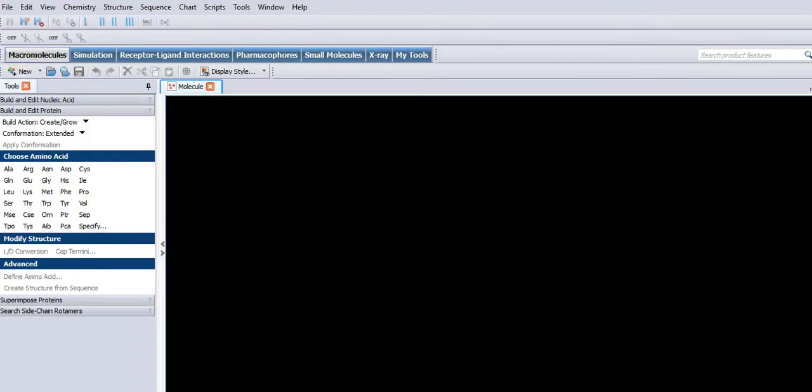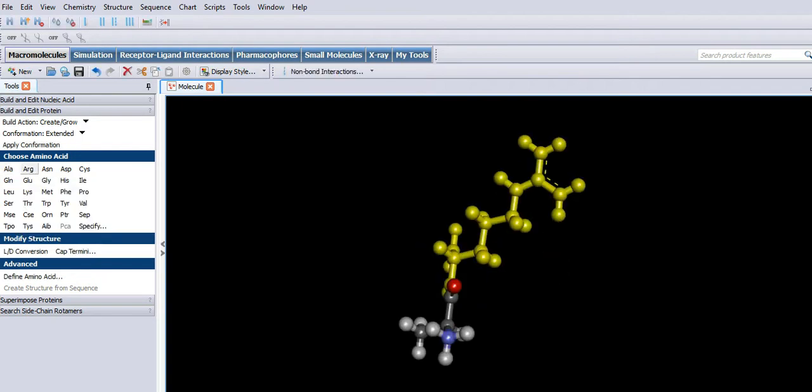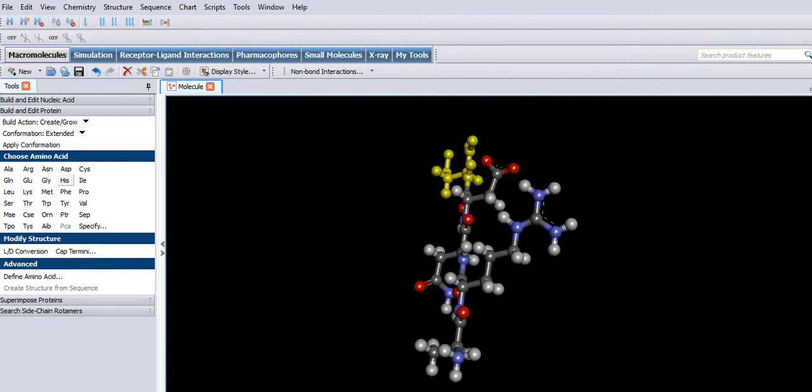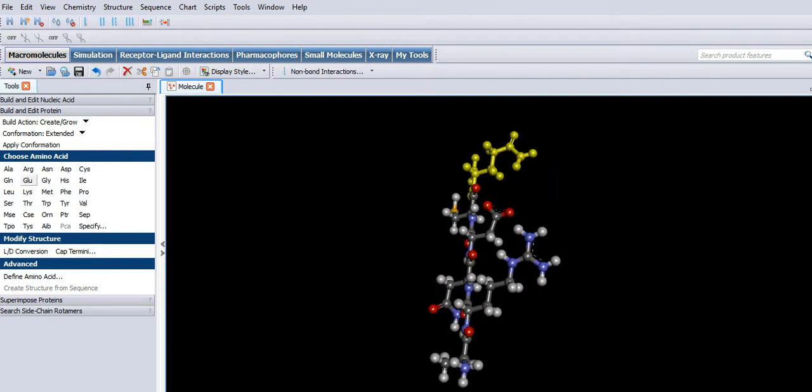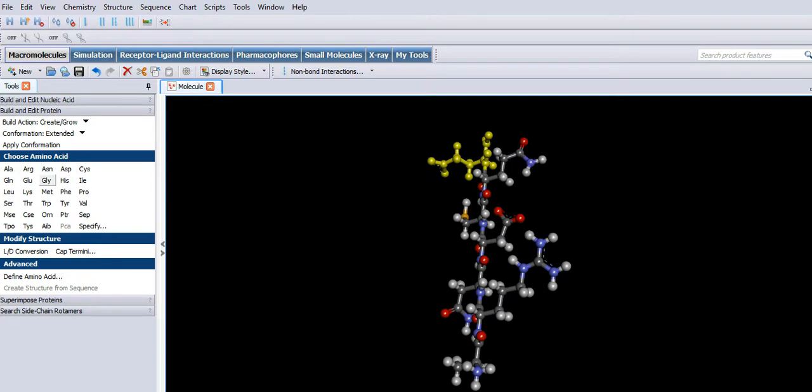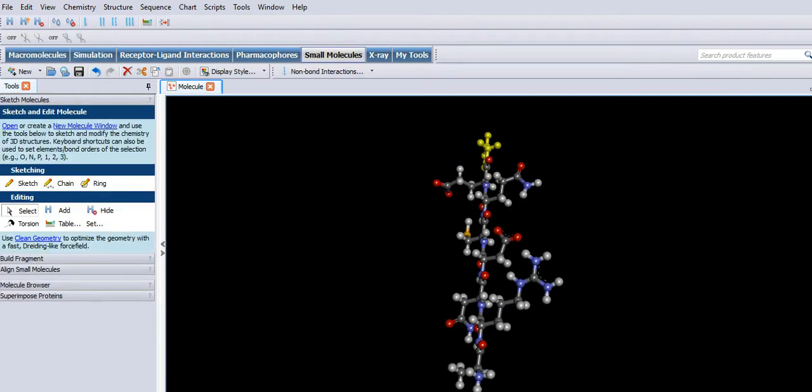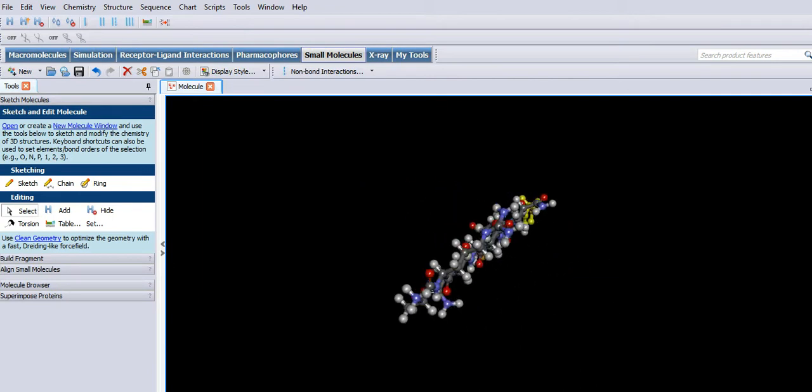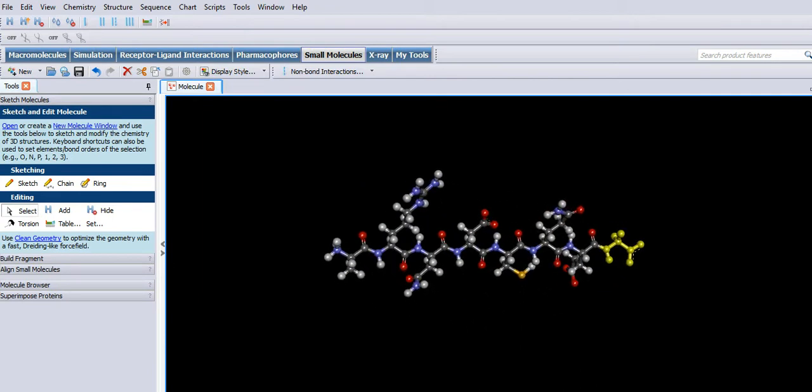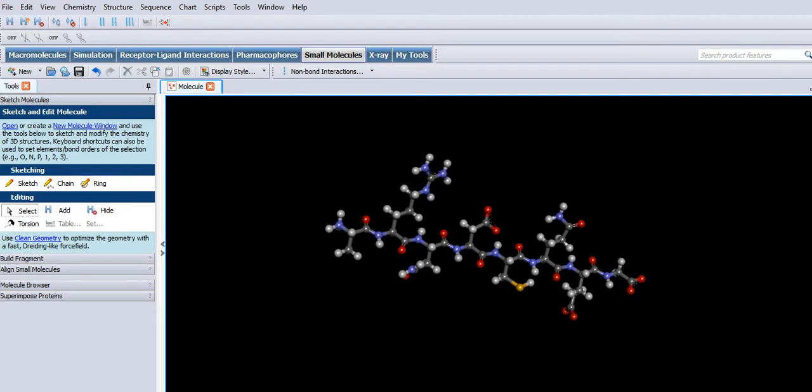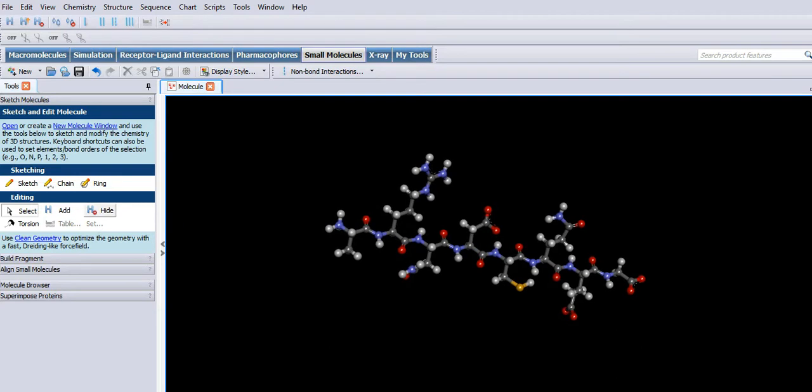Back to small molecules to edit it. Let's lose those hydrogens.